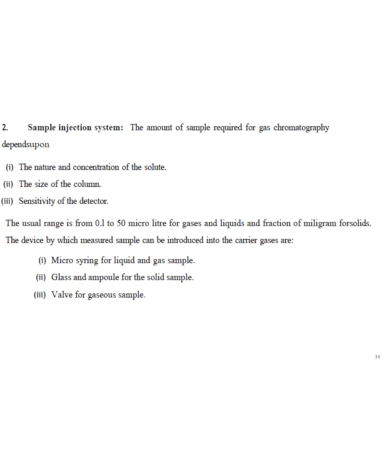Next, the sample injection system. Here, the amount of sample required for gas chromatography depends on the nature and the concentration of the solute. The solute is nothing but the mixture you have taken to separate.